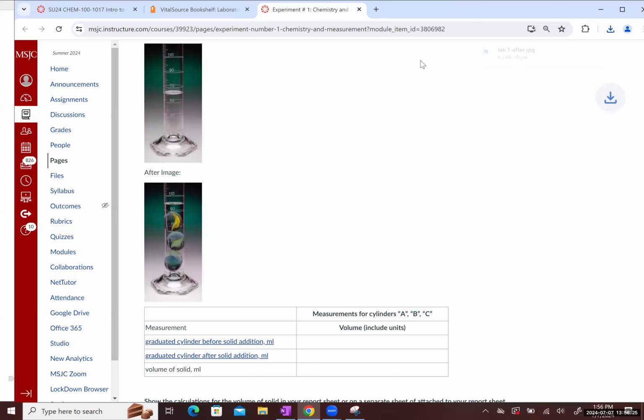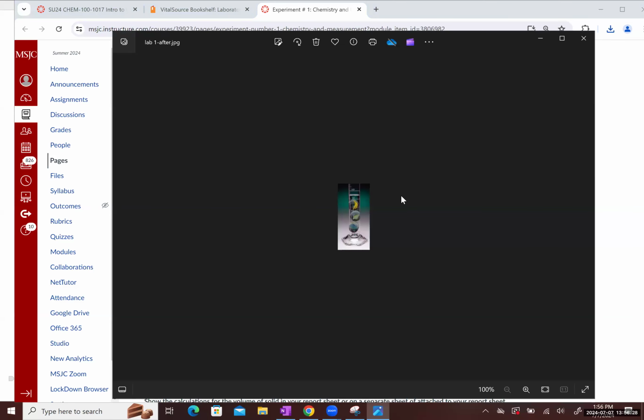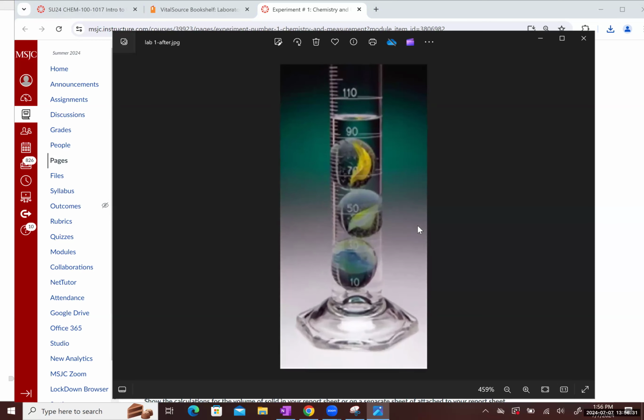So I'm going to, again, open the image and just upsize it a little bit so that way it's easier for us to see on this computerized view. And again, we have the same graduated device. So 1 tick corresponds to 2 milliliters, and a tenth of a tick corresponds to 2 over 10, or 0.2 milliliters. Because we're dealing with the same device, we follow the same graduated tick mark rules. So you don't have to repeat the whole process of figuring out the value of a tick. We're using the same graduated cylinder.